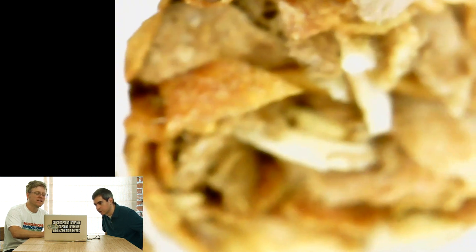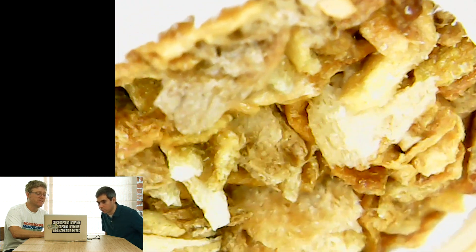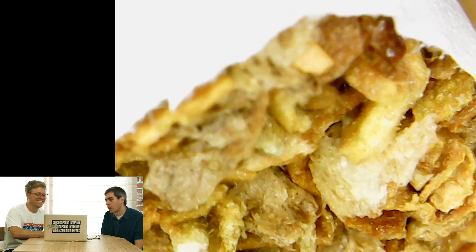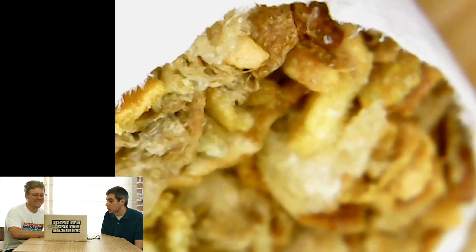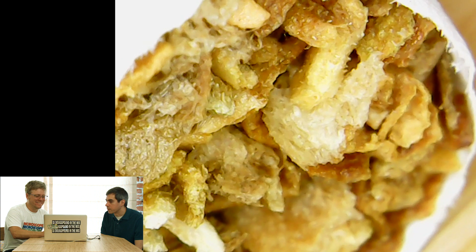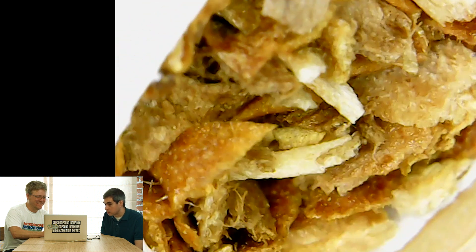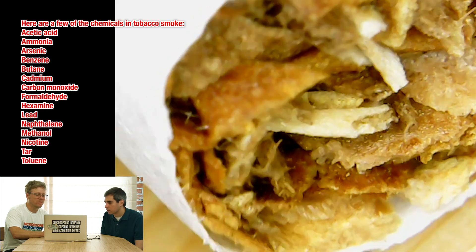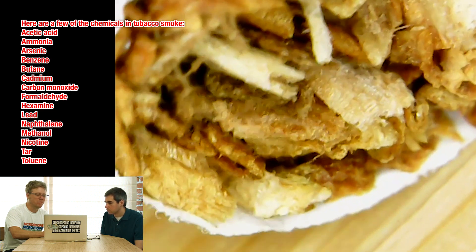Let's look at the tobacco edge. Look at that — it's just plants. Now that doesn't look so bad. This cigarette is vegan. What we're interested in is what kind of nasty stuff is in the tobacco. They say tar and stuff like that — well, it's probably just burning the plant.